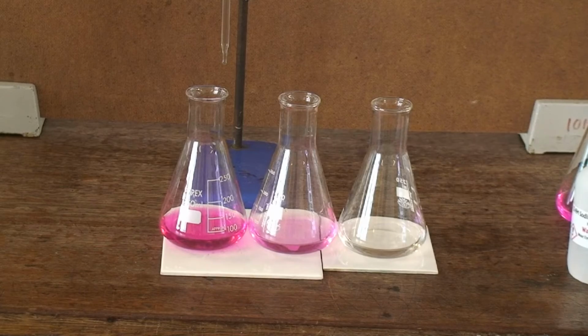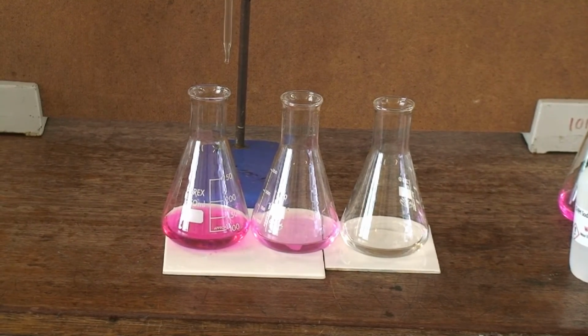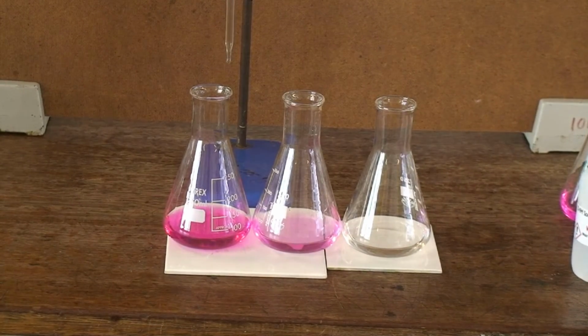Here you can see the three different levels, with the strong pink at the beginning of the titration, the weaker pink as more analyte has been added, and then finally the colourless solution as it has reached the equivalence point.